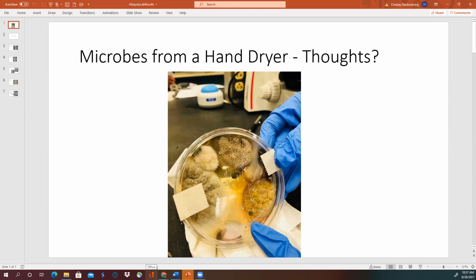So I've already told you that microbes are ubiquitous. They are everywhere, okay? Remember in one of the content videos, I talked about our normal microbiota, which is also called our normal flora, but I tend to use the term microbiota. And those are the organisms that live on our skin or in our bodies, and they're helpful to us, okay? And we're gonna grow some of them, and they're not the prettiest looking species either.